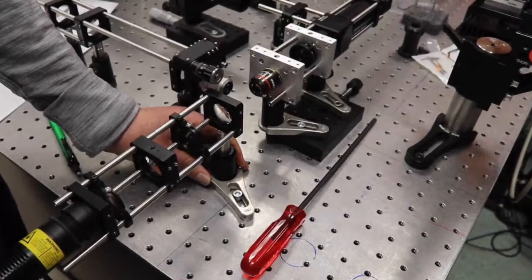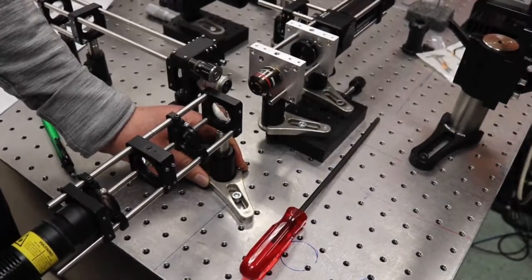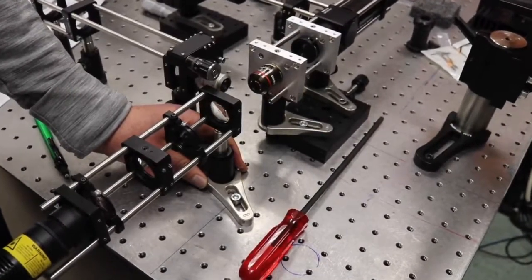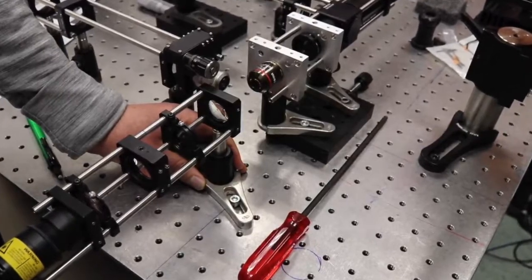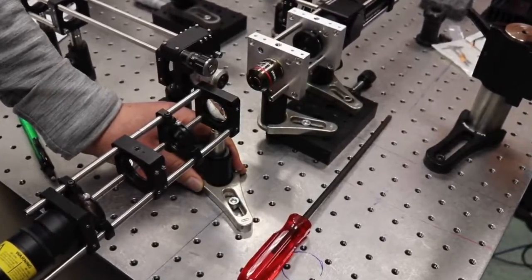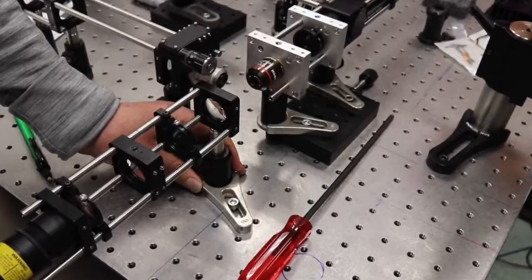Attach a 12.7mm post to the cage plate containing the condenser lens and mount the assembled condenser on a post holder. Make sure that the height of the illuminator is the same as the microscope.